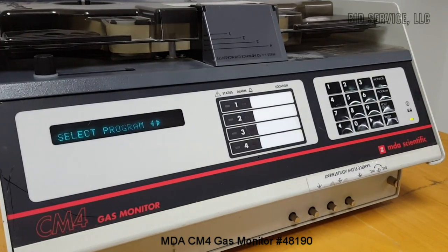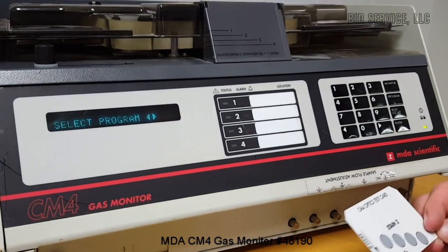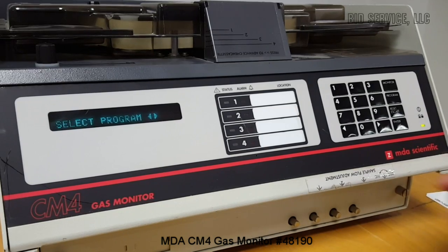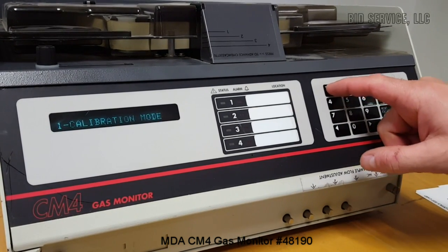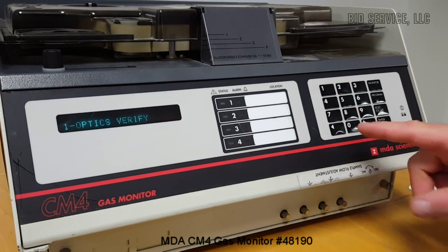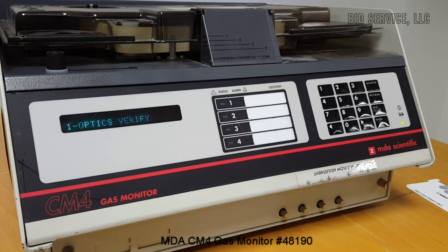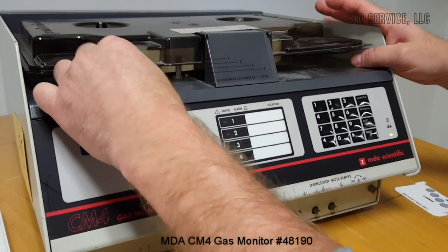You can also verify that the optics are working correctly using this card — stain two, stain one. There's a process where you can go into calibration mode to verify your optics. When you do this test you have to, of course, remove the Chem cassette.